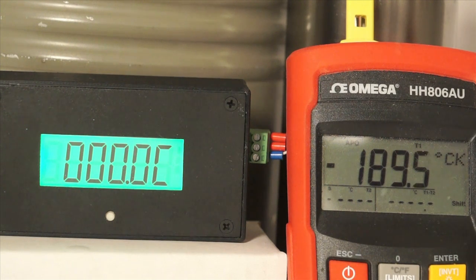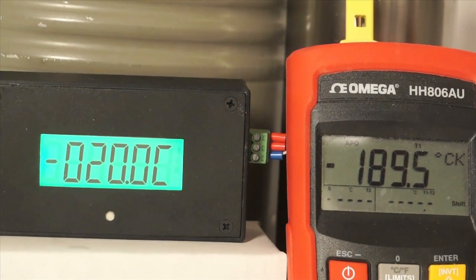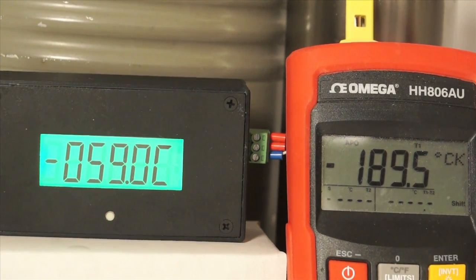Now the temperature of liquid nitrogen is minus 195 centigrade. It's minus 320 Fahrenheit.